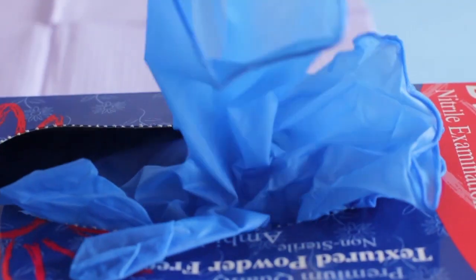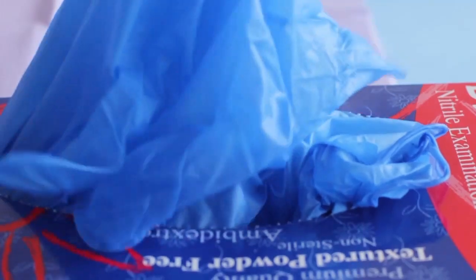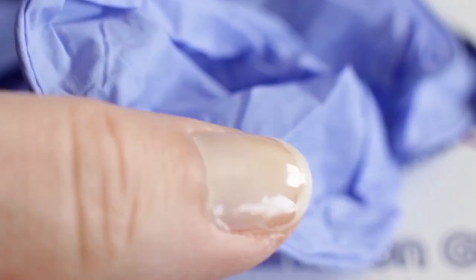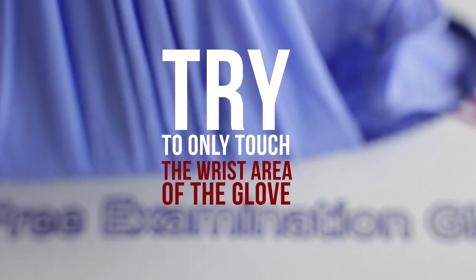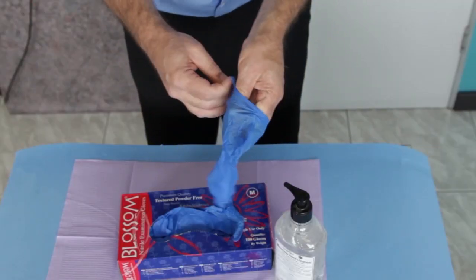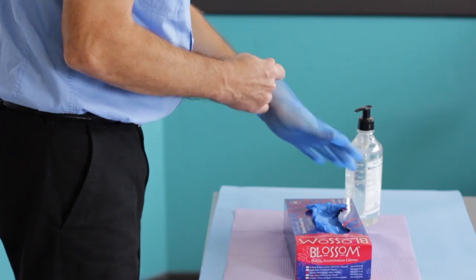Touching only the cuff, take the first glove out of the original box. Try to only touch the wrist area of the glove, in other words, the top end of the cuff. Don the first glove by sliding it over the fingers, palm, and wrist.